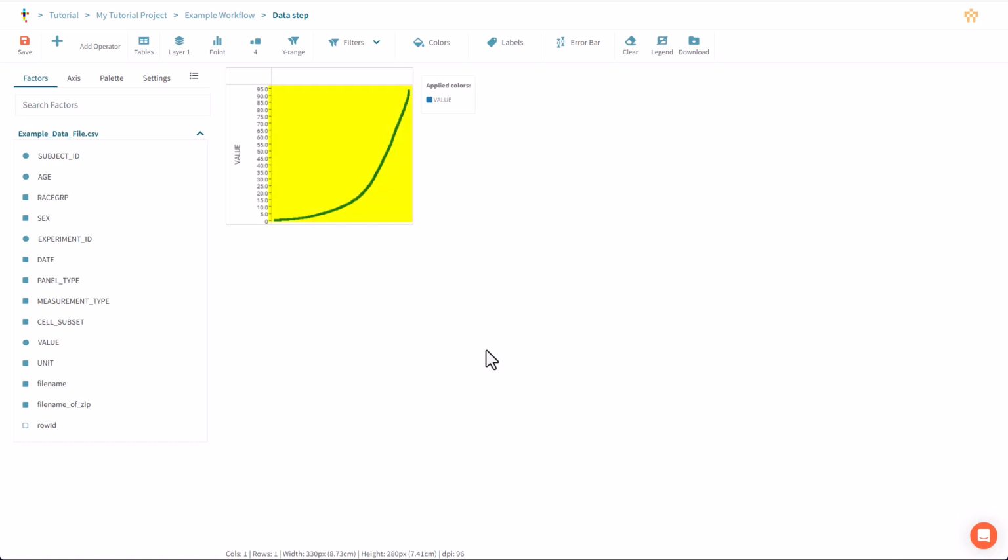The central part of the crosstab is called the data cell. Unlike a spreadsheet, Tercen data cells can hold multiple numbers. All of the values are here, ordered from lowest to highest. We recommend that you start every projection by placing your main measurement on the y-axis.